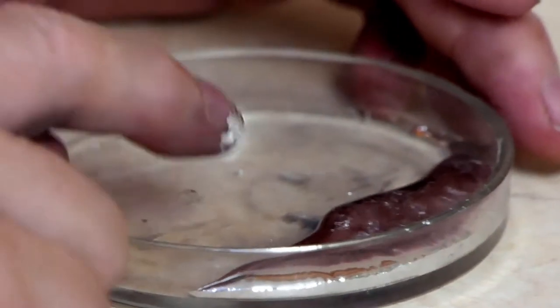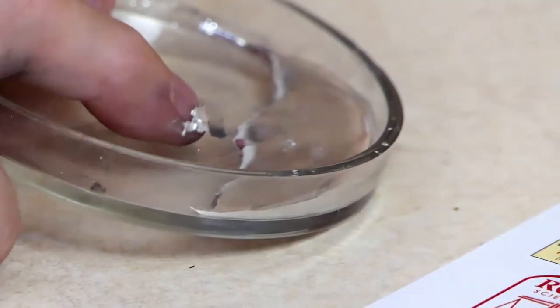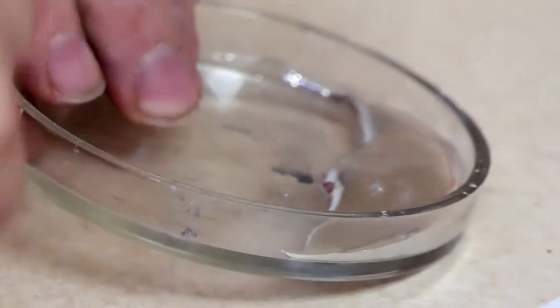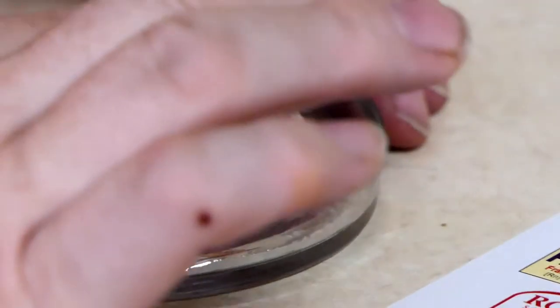It forms what we call a positive meniscus. Instead of water spreading out and going down in the middle, the gallium makes this closer join with the glass and then bulges out. So positive meniscus.